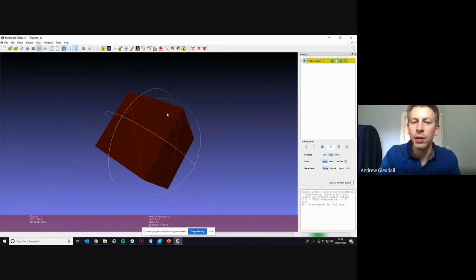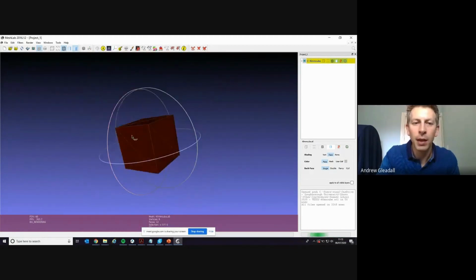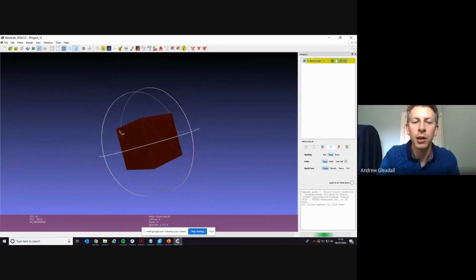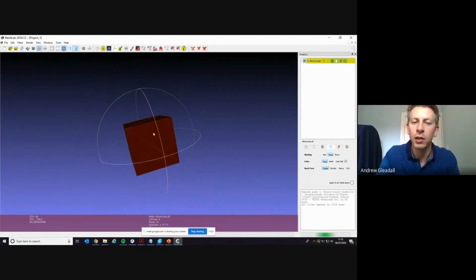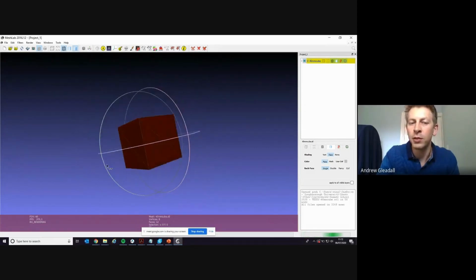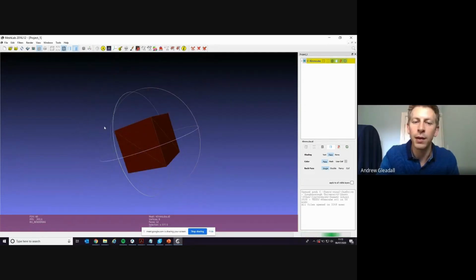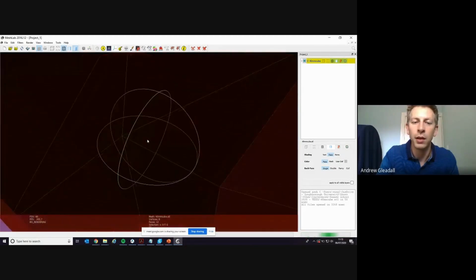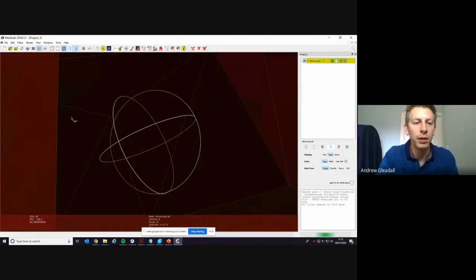And that's what the STL file is. It's a cube, but it's made up of triangles because STL files have to be triangles, and it's just using 2 triangles to create one face of our cube. And all those triangles are just linking the different coordinates of our corners to say this is our 3D model of a cube, and it'll be hollow on the inside. If I zoom in, you can't really see. It's just a surface.